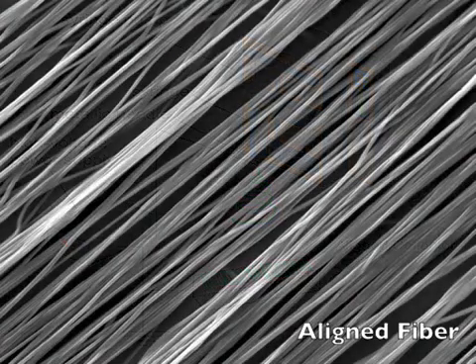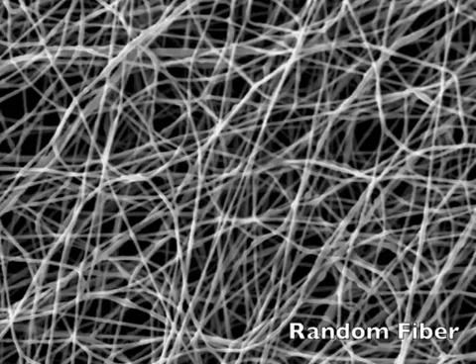The result is a dry, nanoscale polymer fiber that can be collected in a number of ways for various applications.